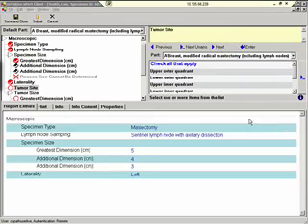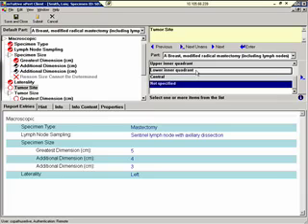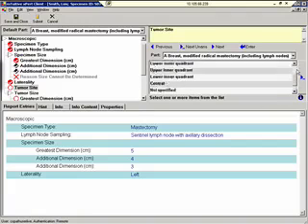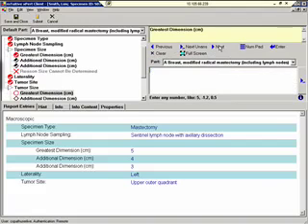The mTuitive xPert system is running in the background, and it's smart enough to know that in regards to this specific field, multiple pieces of data can be accepted. The xPert system also prevents the end user from selecting multiple pieces of data that do not make sense, such as, we'll select Not Specified, and we'll also try to select Lower Inner Quadrant. As you can see, the system will not allow this. We must deselect Not Specified before making another selection. We'll pick Upper Outer Quadrant.